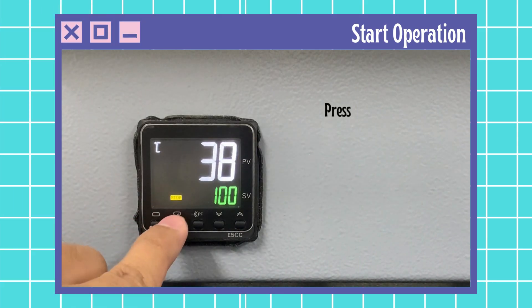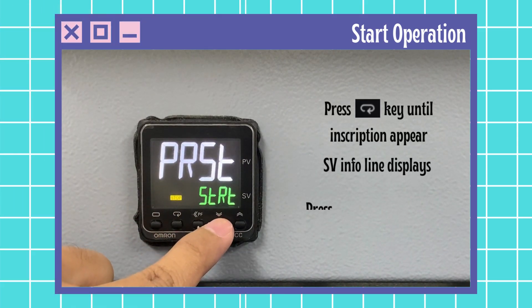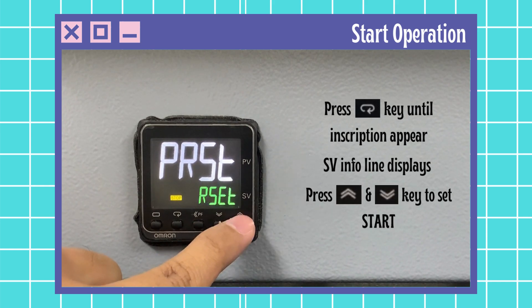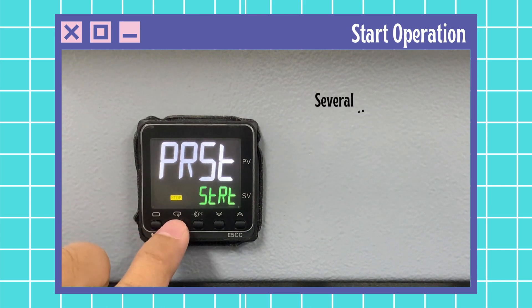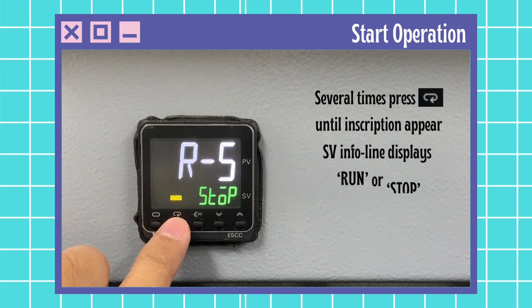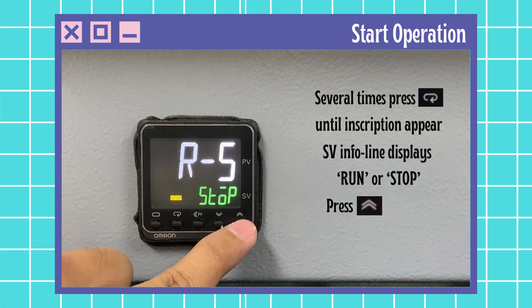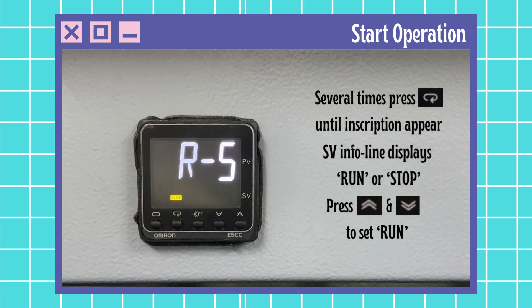Then start the operation by pressing the mode key. The inscription will appear: Set value, info, reset, or start. Press up and down key to choose start and wait for a moment for it to set. Press mode key several times until the inscription RS appears, then press up and down button to set run. Wait for 2 to 3 seconds for it to set.